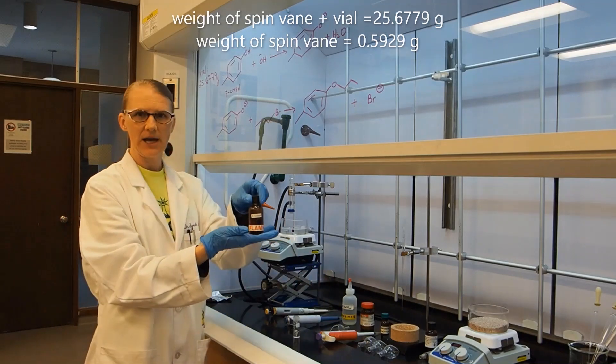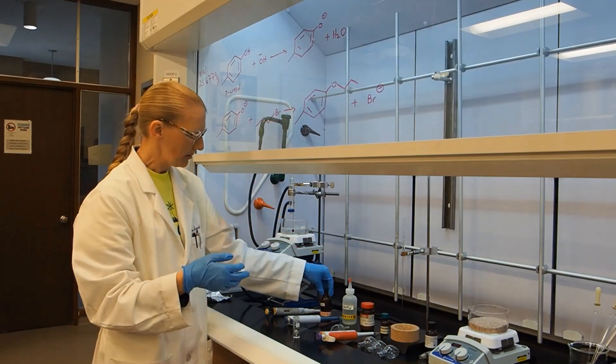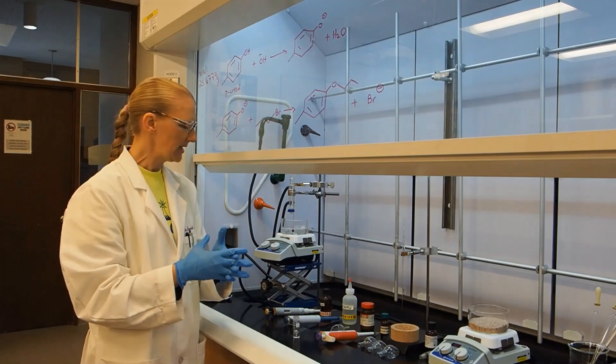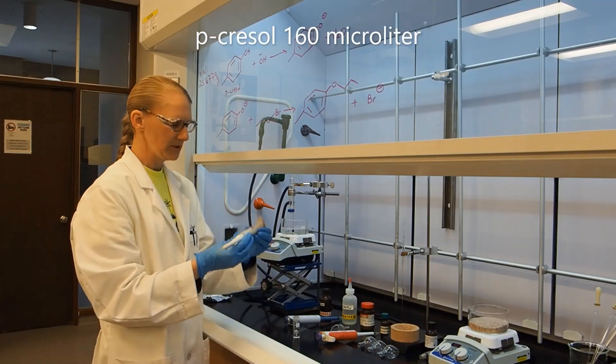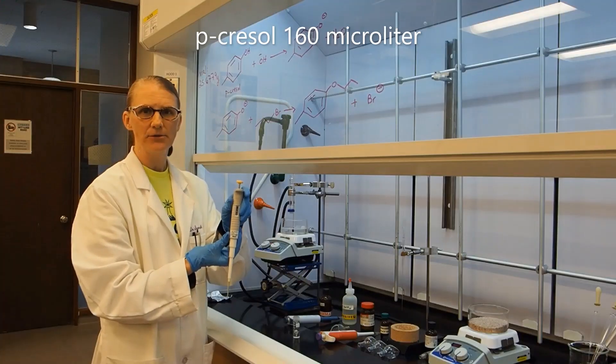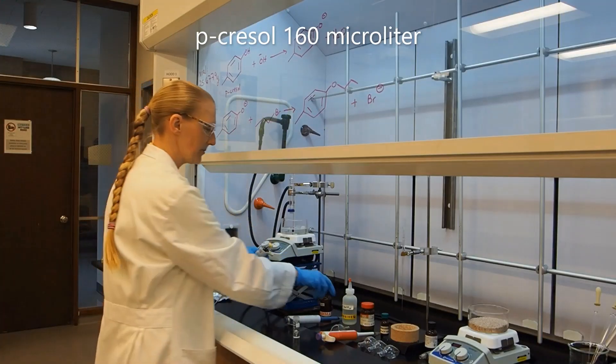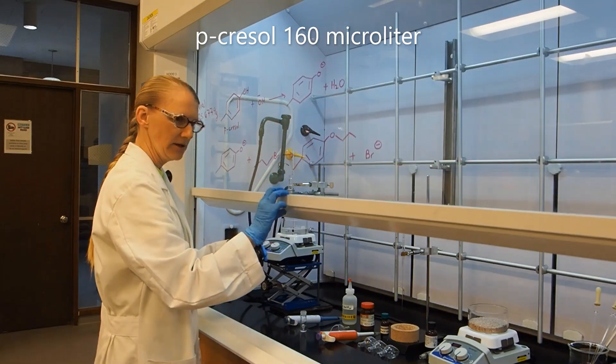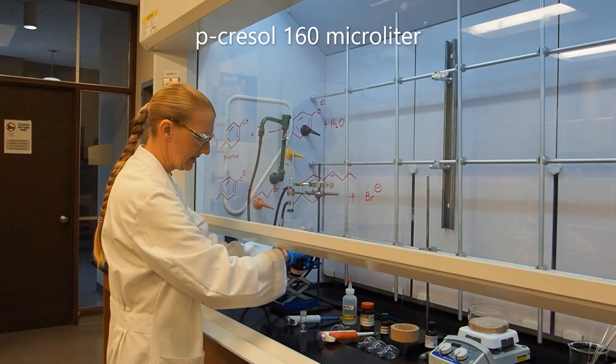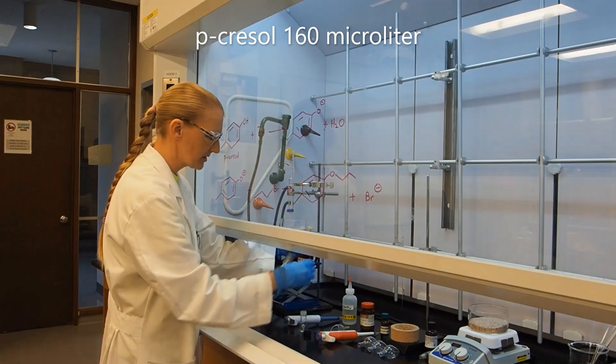The first reagent we're going to add is p-cresol. P-cresol is a sensitizer and an irritant, so I'm working with it in the hood. I'm going to measure out 160 microliters using an automatic pipette and add it to the vial. I'm going to keep the hood low because this is really not something I want to breathe or smell.